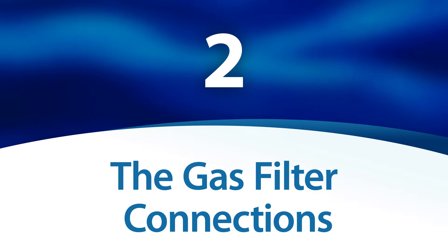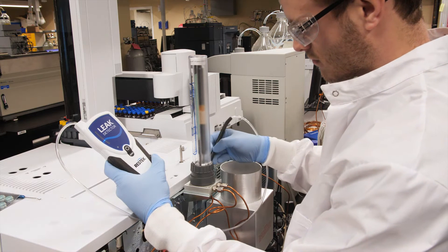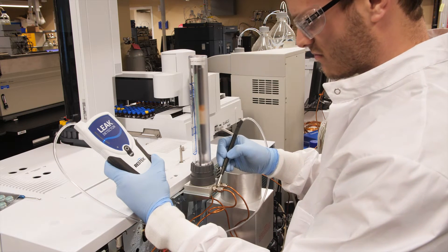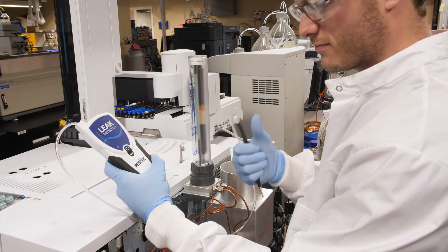The gas filter connections. Check for leaks any time you install new or replacement gas filters. If one of your gas filter compression fittings is leaking, check the fitting to make sure it is in good condition, then tighten it appropriately.